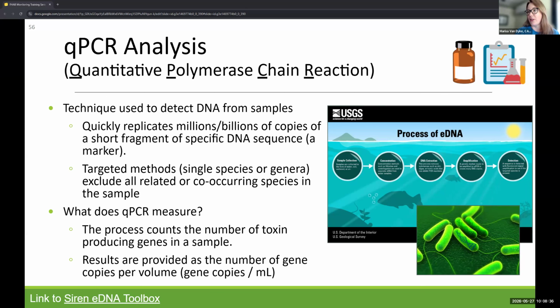This analysis is also available for golden algae. It's a harmful algae, a proper one, not a cyanobacteria. It's also useful in water monitoring as well. And so, as mentioned before, we can develop a tiered approach of lab analysis.